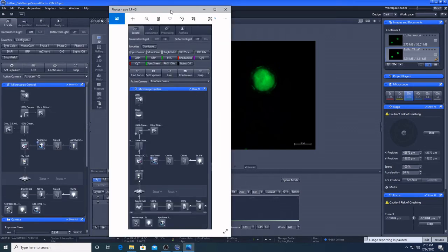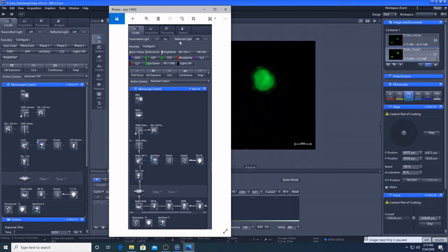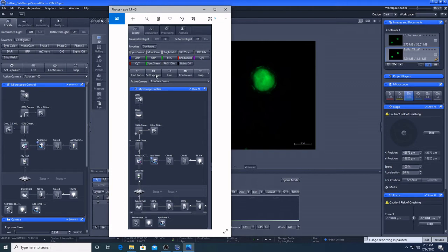So we're just going to quickly talk about the differences between the AxioImager 01 and the AxioImager 02. So I've just got a screenshot of the equivalent locate tab on the AxioImager 01. That's the easiest way to compare them. So the first thing to say is the AxioImager 01, it does have a slightly better colour camera. It's got the Axiocam MRC.